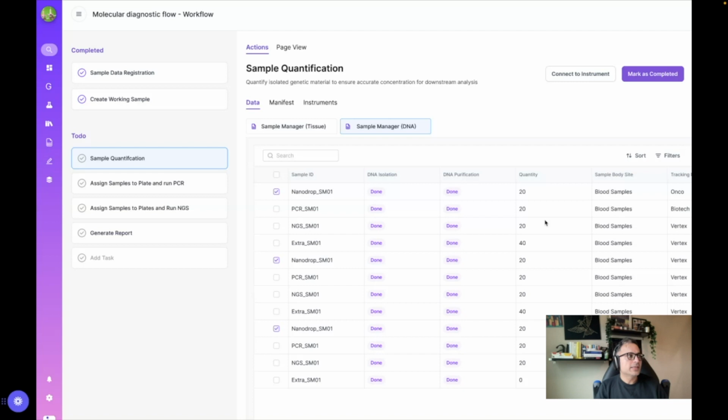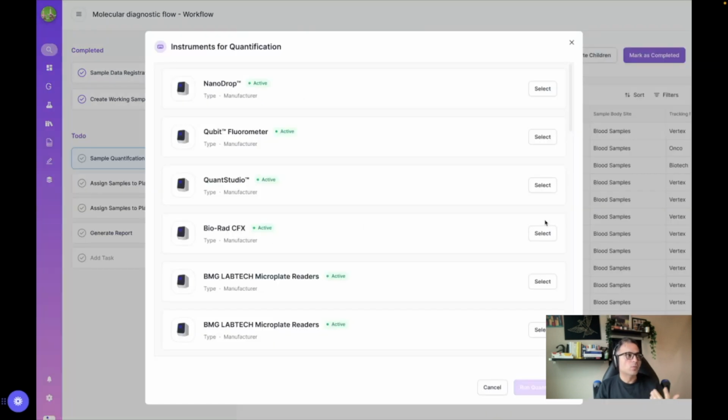Next, let's say I want to start another workflow where I'm bringing in data from the instrument. Depending on the instrument, this could be automated, semi-automated, or manual. Again, it depends on where the source data is coming from. The most common use case I've seen is people use the Scispot agent to take the data from their instrument's Windows machine.